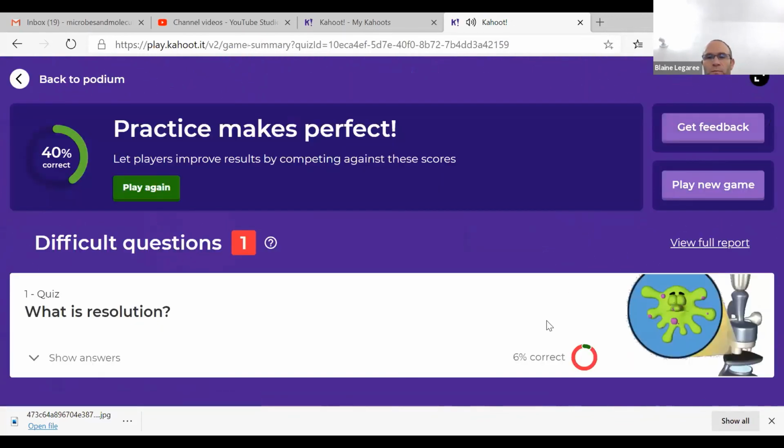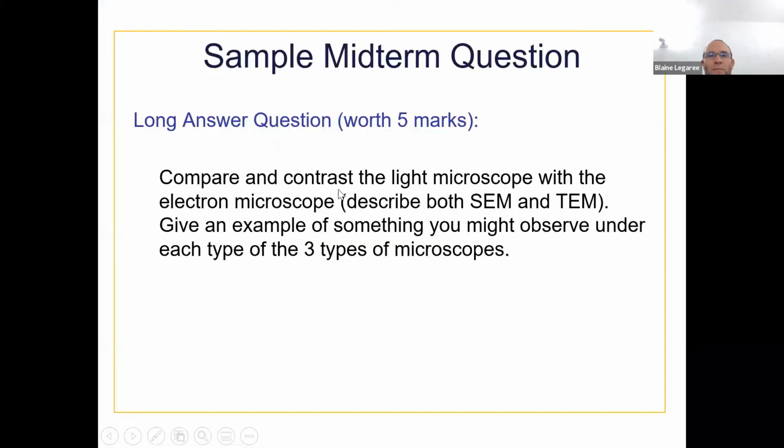Okay, so I'm going to go back to the PowerPoint. I realize that we're running out of time here. But I want to discuss a couple other things and then I'll let you go. And the rest of the topic I will just leave till last day. So as I mentioned, this has been a pretty typical kind of midterm question. I have a few of these around microscopy. You can see this particular one is actually asking you to compare light and electron microscopy. And it does distinguish and say, describe both SEM and TEM. I could easily make a question comparing light microscopy, electron microscopy, and probe microscopy.